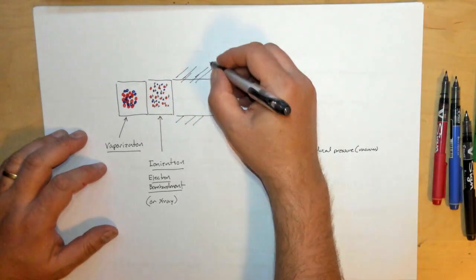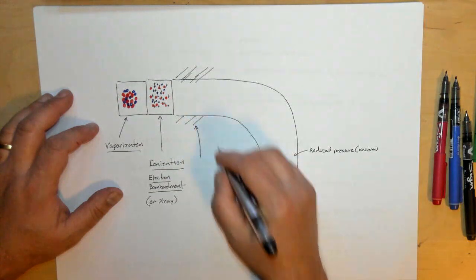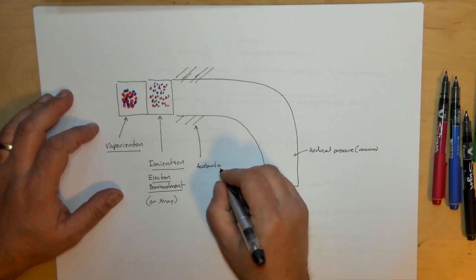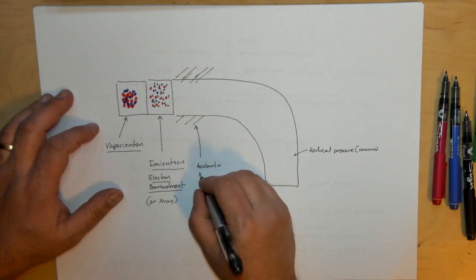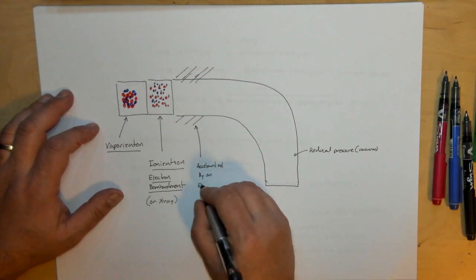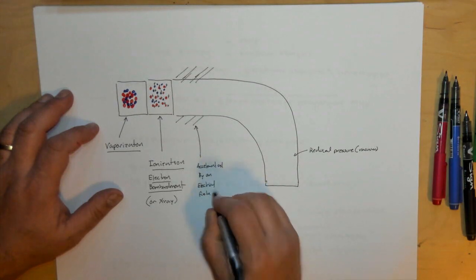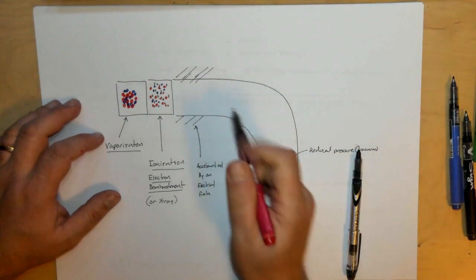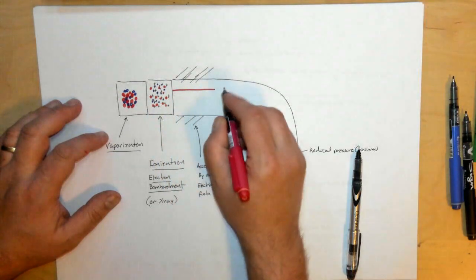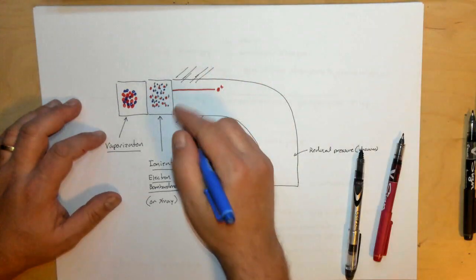And what you then are able to do if you have a charged particle is that you can accelerate them. And you accelerate them by an electrical field. So they start to shoot down this tube. They start to accelerate, and then they reach some sort of velocity. And so now you have a charged particle that's traveling down this tube.